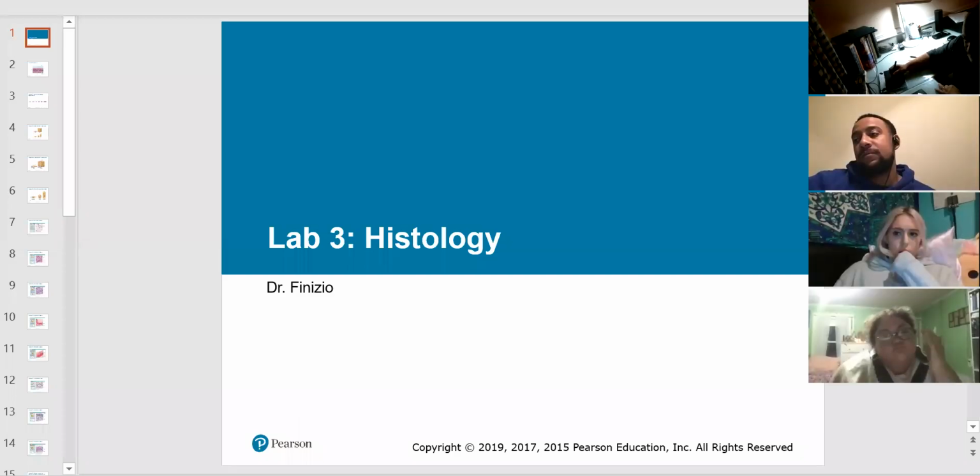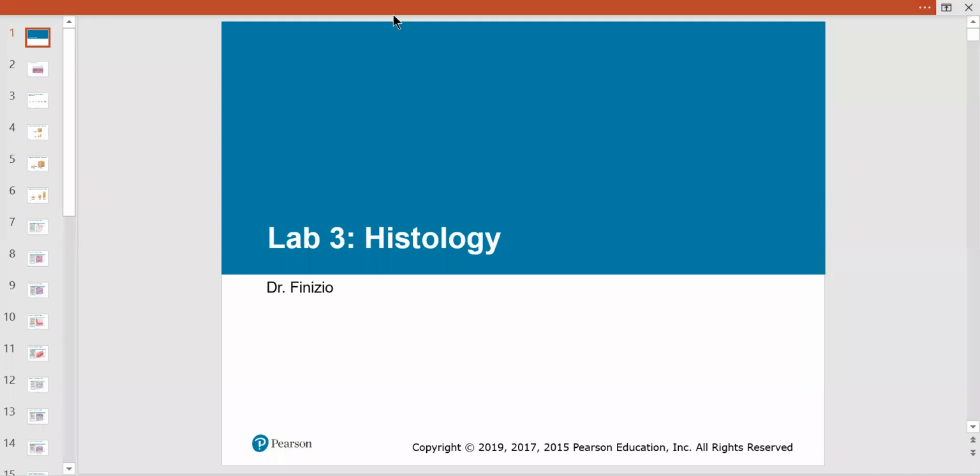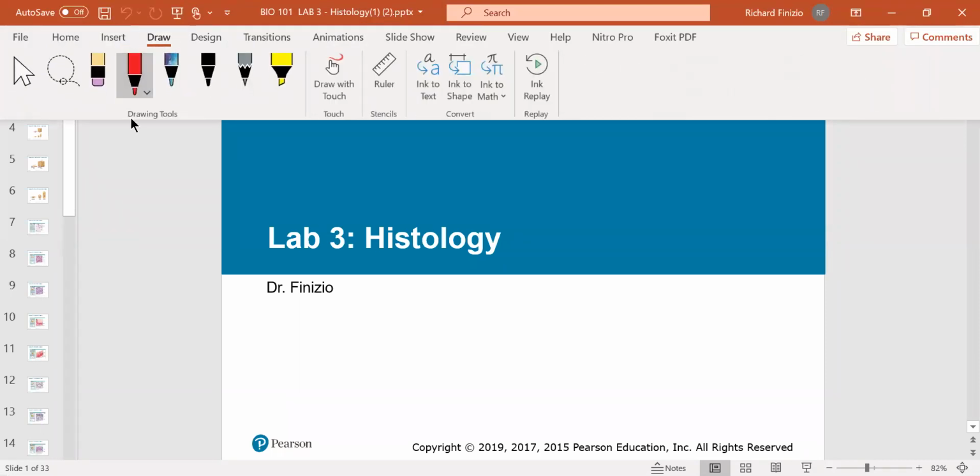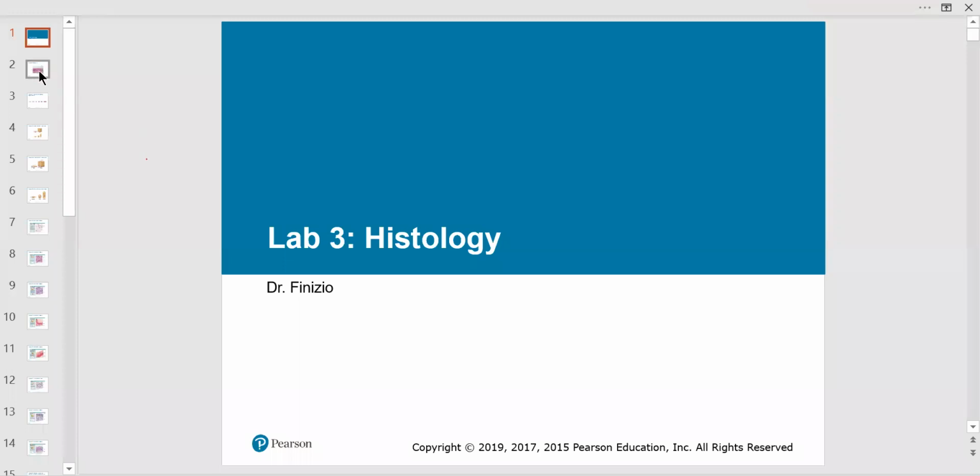So this is lab histology, the lab part of it. And it's kind of the same. But on my exam, on my practical, it's mostly identifying the tissue types, specific tissue types. So this is where we're going to live now.